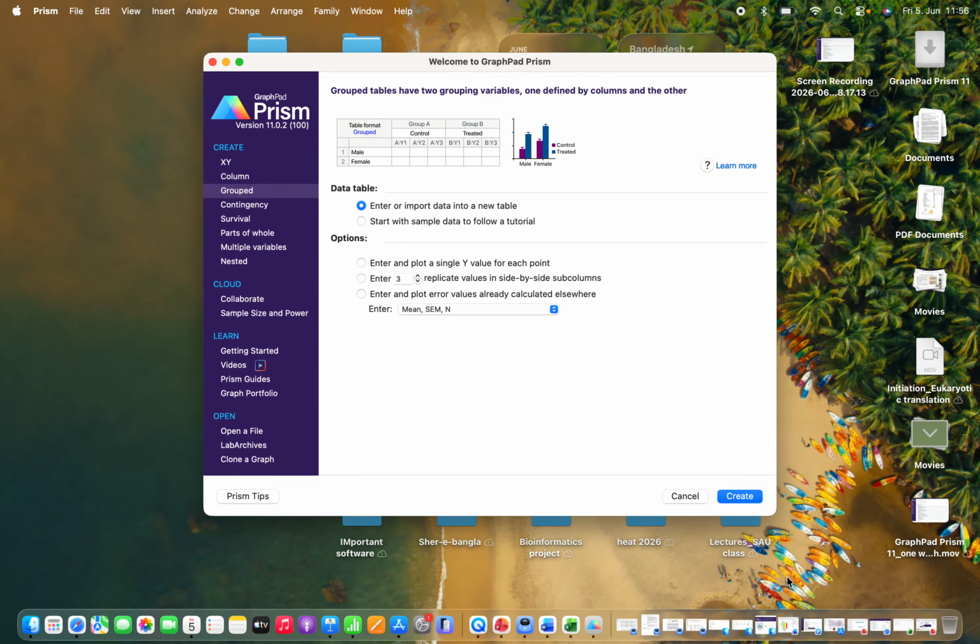Hello audience, today I will show you how to create a two-way data graph by using GraphPad Prism 11.